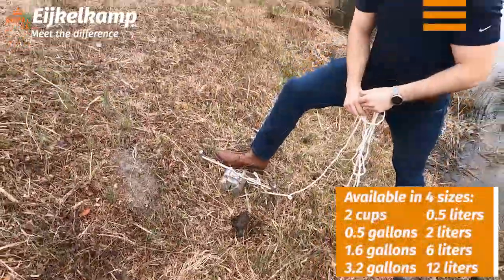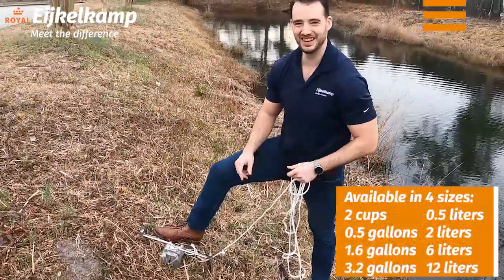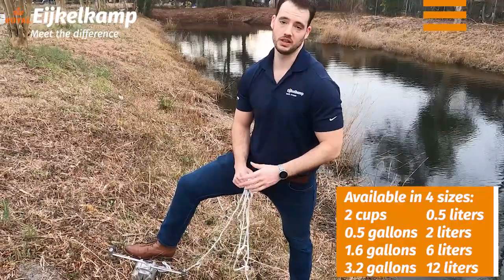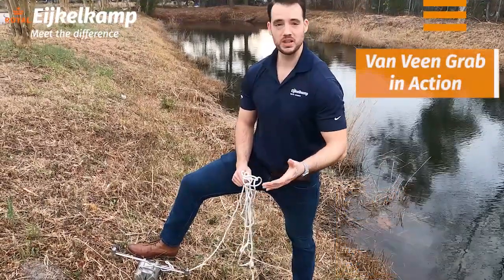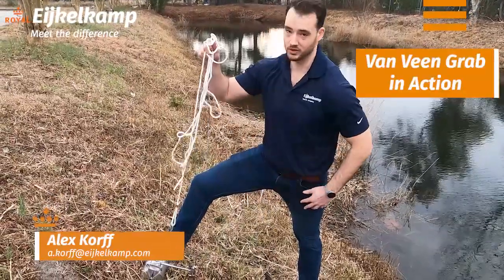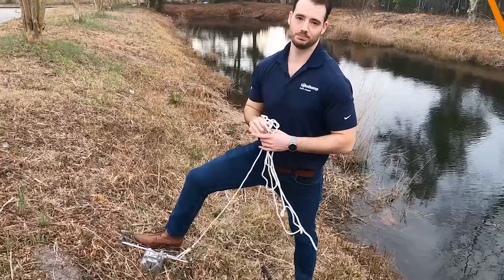There we go. Got a little bit of muck. That's really the goal, right? Those unconsolidated samples. Now you'd pull the sample you need, send it off to the lab, get the data that you need. Whether you're looking at PCBs in the bottom of a lake or stream bed, this is a great little piece of equipment for sampling. This is Alex with Eichel Camp. Meet the difference.